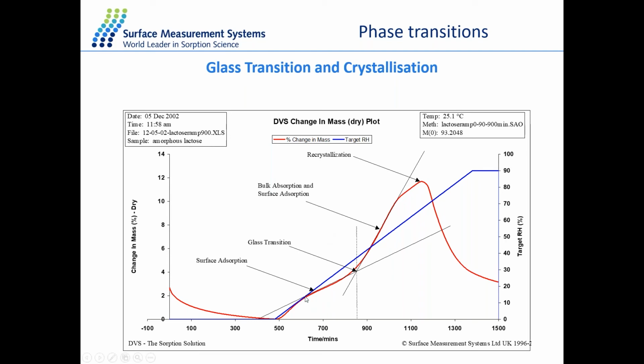At a certain level of relative humidity, there are enough molecules that the surface of the sample, which is obviously glassy at the beginning, moves to a rubbery condition, because the solvent that we are adding is acting as a plasticizer. Once the sample surface has moved to the rubbery condition, then molecules can not only absorb on the surface, but also penetrate through the bulk. Once the molecules reach the bulk, we have our bulk sorption. Because we have bulk sorption, now we are able to absorb many more molecules. So it's faster right here, sorry, right here is faster than it was before.